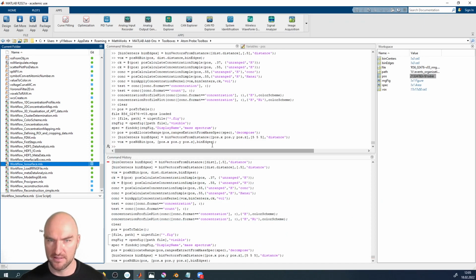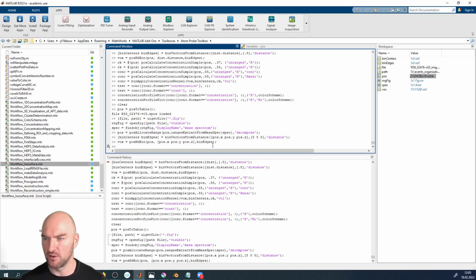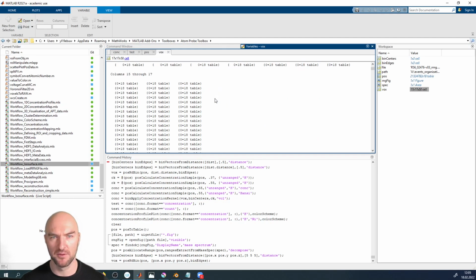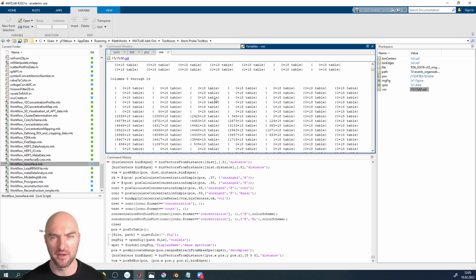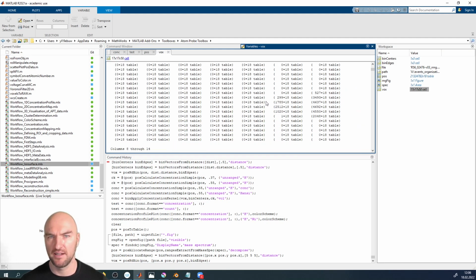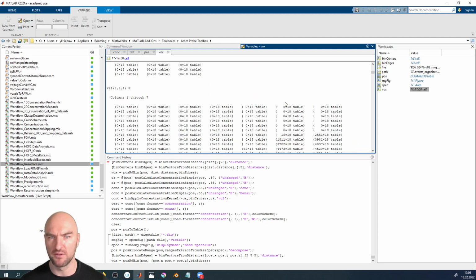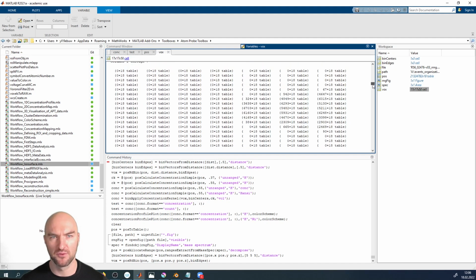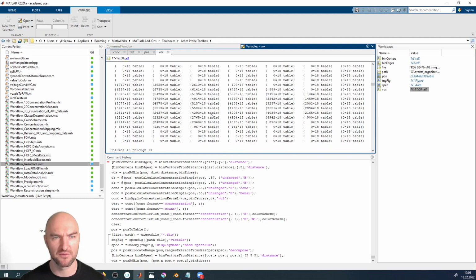The downside of this is, of course, that sometimes you would just want to go with the ranged atoms or whatever. And now what we have is a variable where you can see that sometimes we have entries, and you can see in the voxels that are relatively full, how many atoms do we have in the larger voxels?